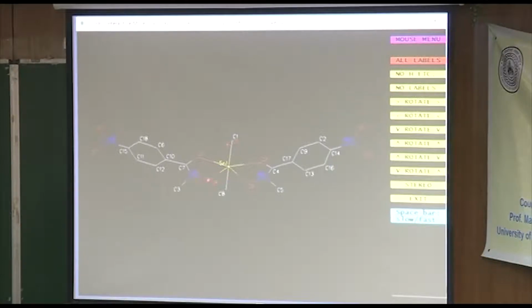And this nitrogen here, I actually had to look up what that was on the CSD. So it's, do I have it in my pocket still? That particular ligand, if it's correct, is what is called a hydroxamic acid. So it will have been deprotonated, and so each ligand will have a -1 charge, and then the methyls contribute a -1, so it's tin 4, which makes sense. Okay, so let's try refining it like that.